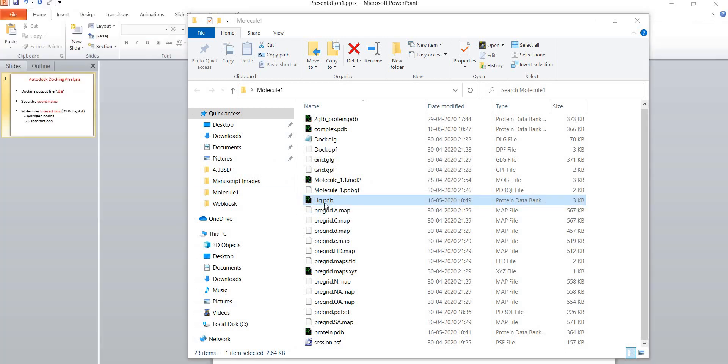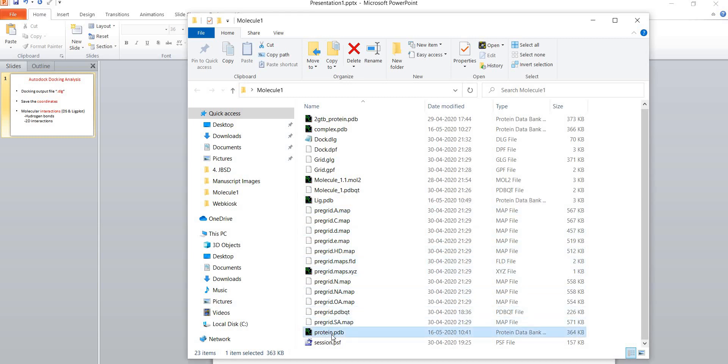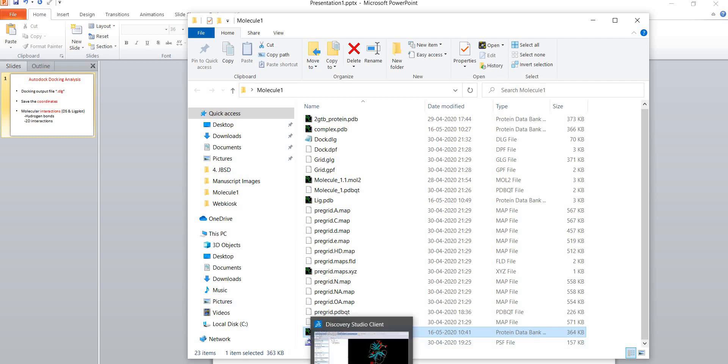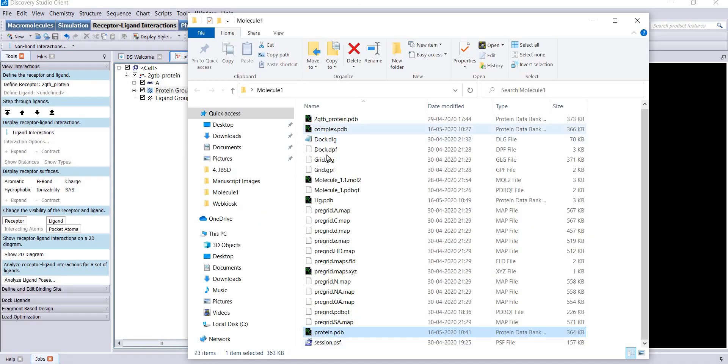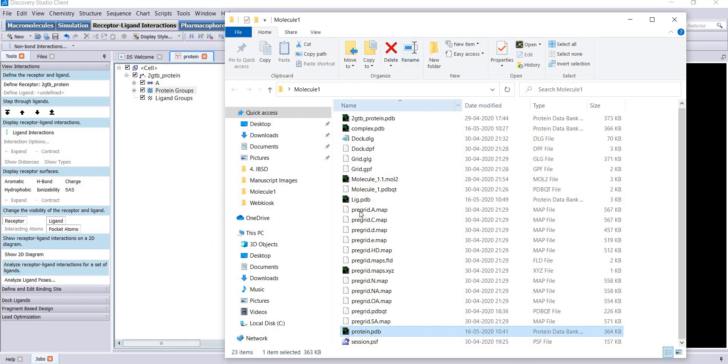Now here is your ligand file. I want to open the protein file which was used for your docking. I will open it in Discovery Studio software, go to the folder.